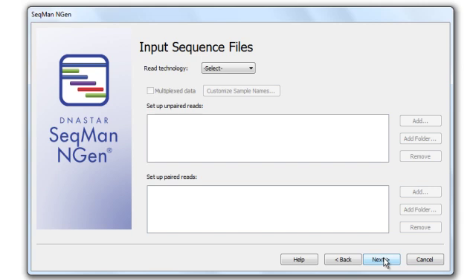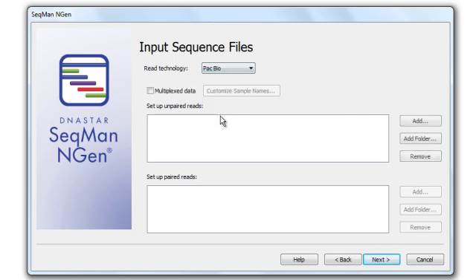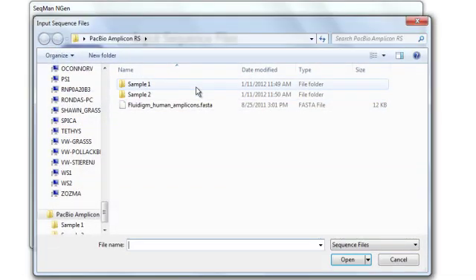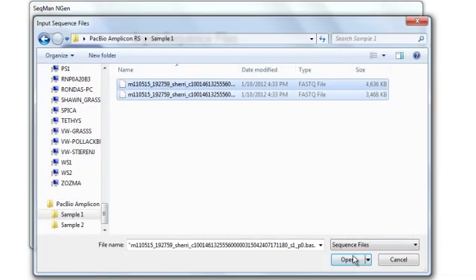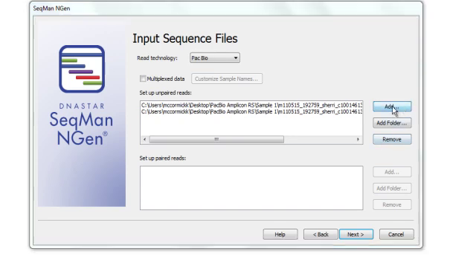The next step is to input my sequence data. The first thing I need to do is to select the read technology, which in this case is PacBio. Then click Add next to the Setup Unpaired Reads box. Navigate to my files, and click Open.